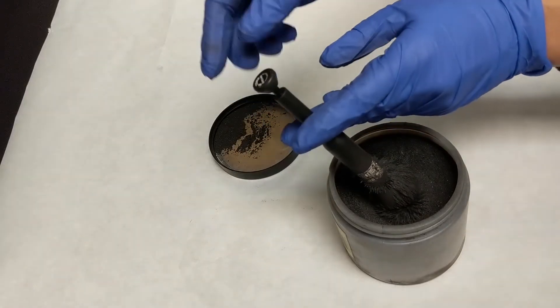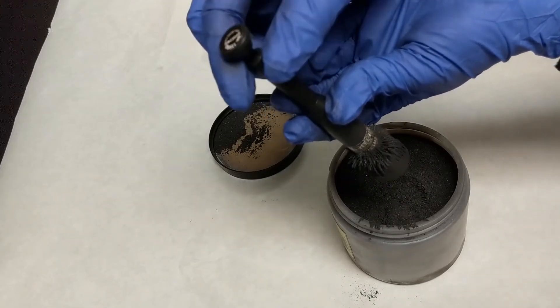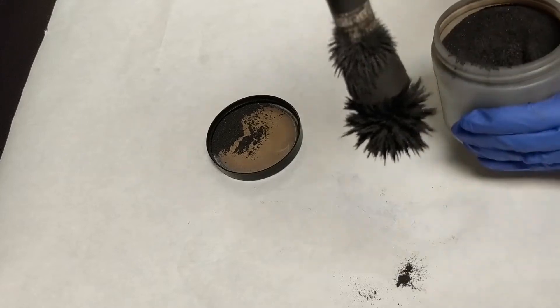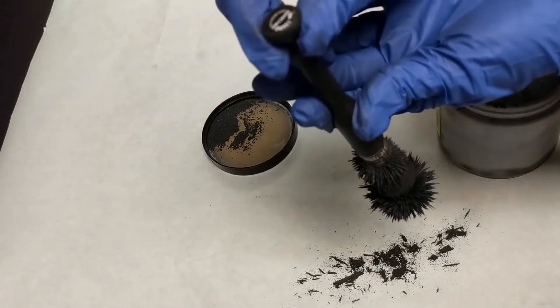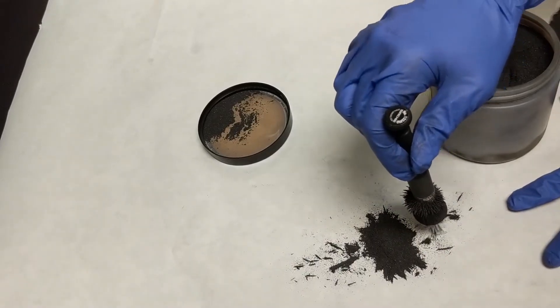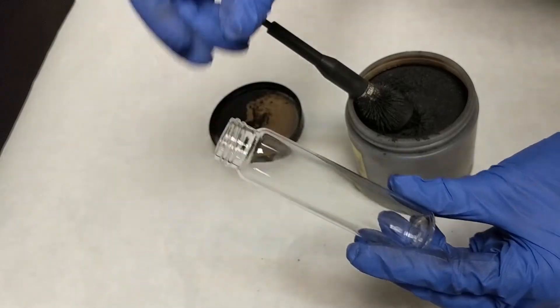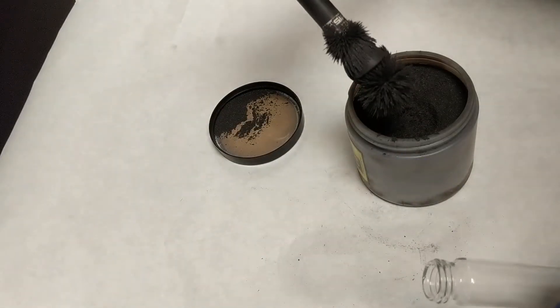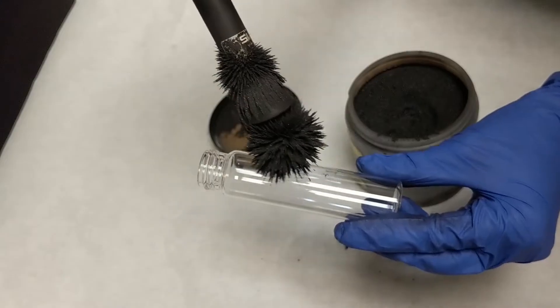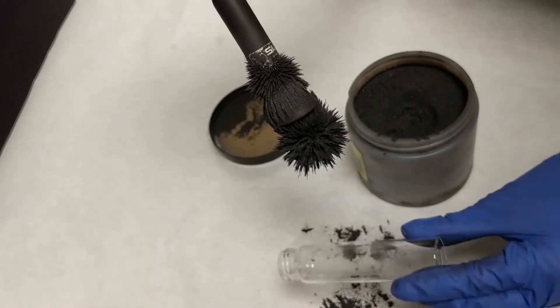Charcoal powder is most commonly used by investigators, however one very strong advantage of magnetic powder is that it is very easy to clean up. The powder itself is magnetic, and instead of using a brush, investigators use a wand. The wand has a plunger on one end that, when pulled, moves a magnet on the other end. The magnetic powder is attracted to the wand when the plunger is down and released when the plunger is lifted. The process of dusting with magnetic powder is essentially the same as with charcoal powder — the powder is lightly applied to the surface, then tape is used to lift the print.